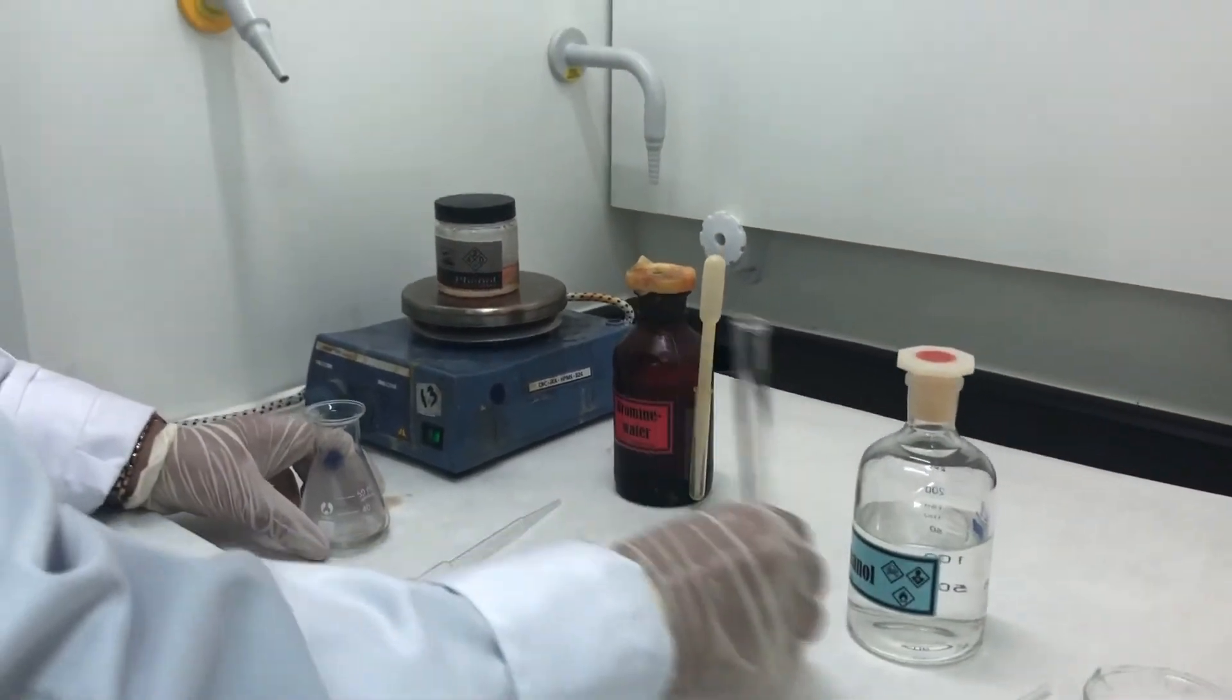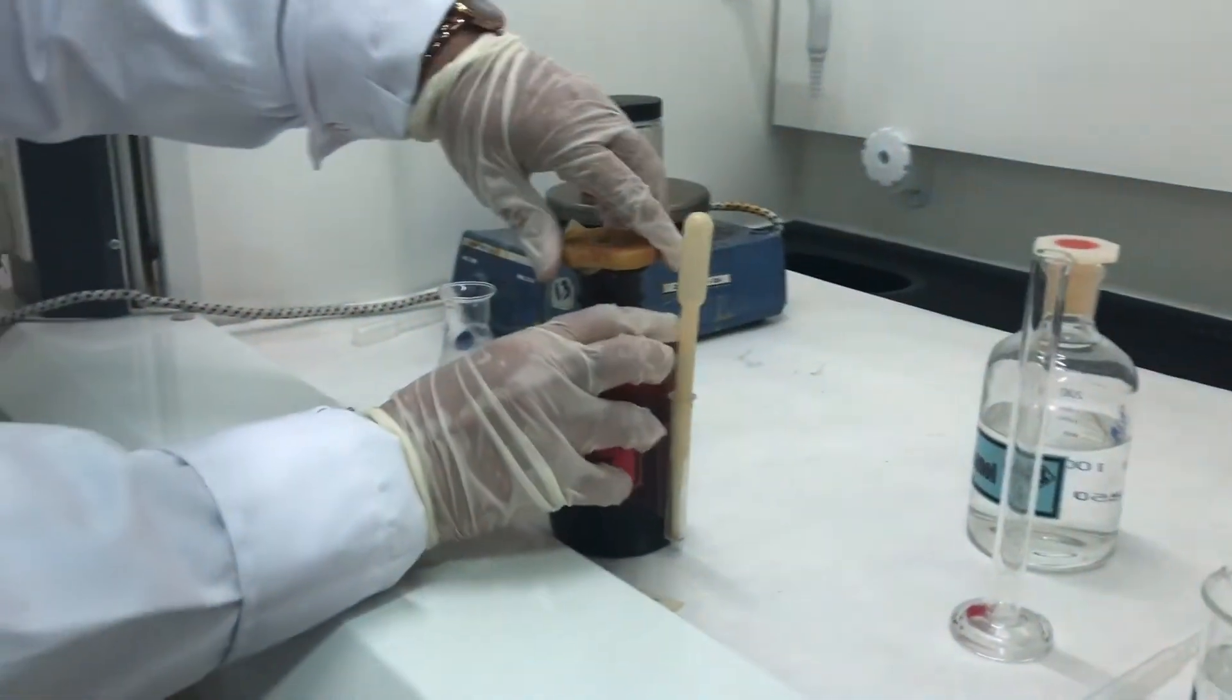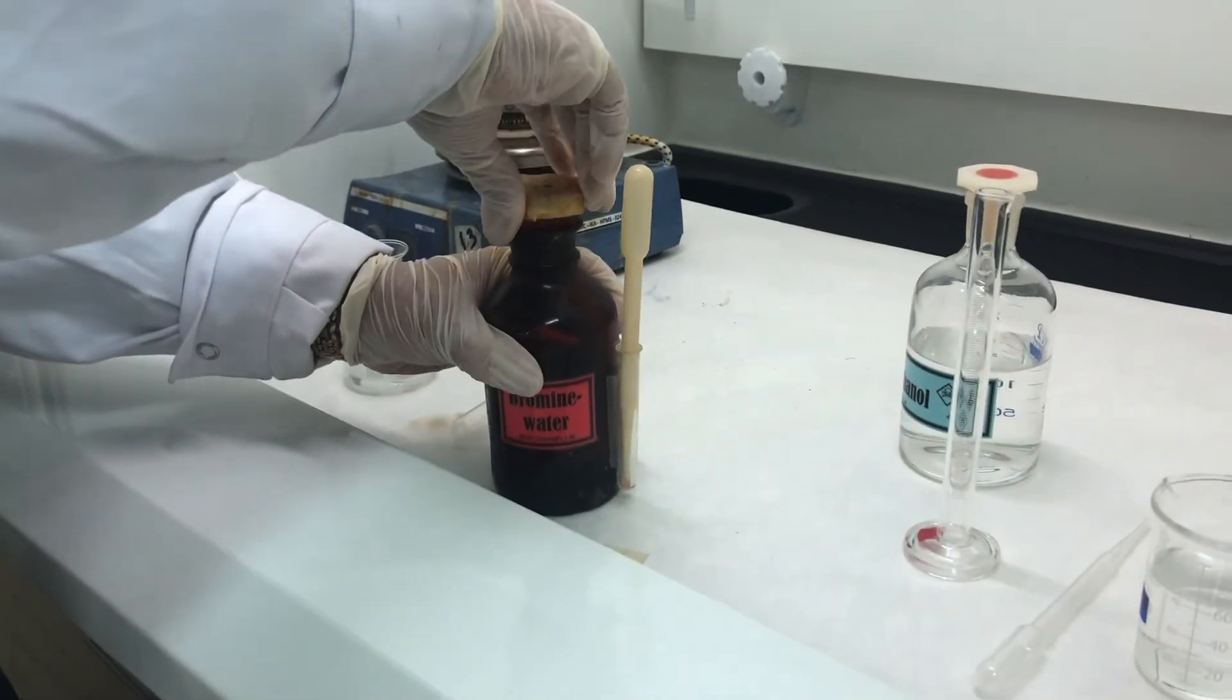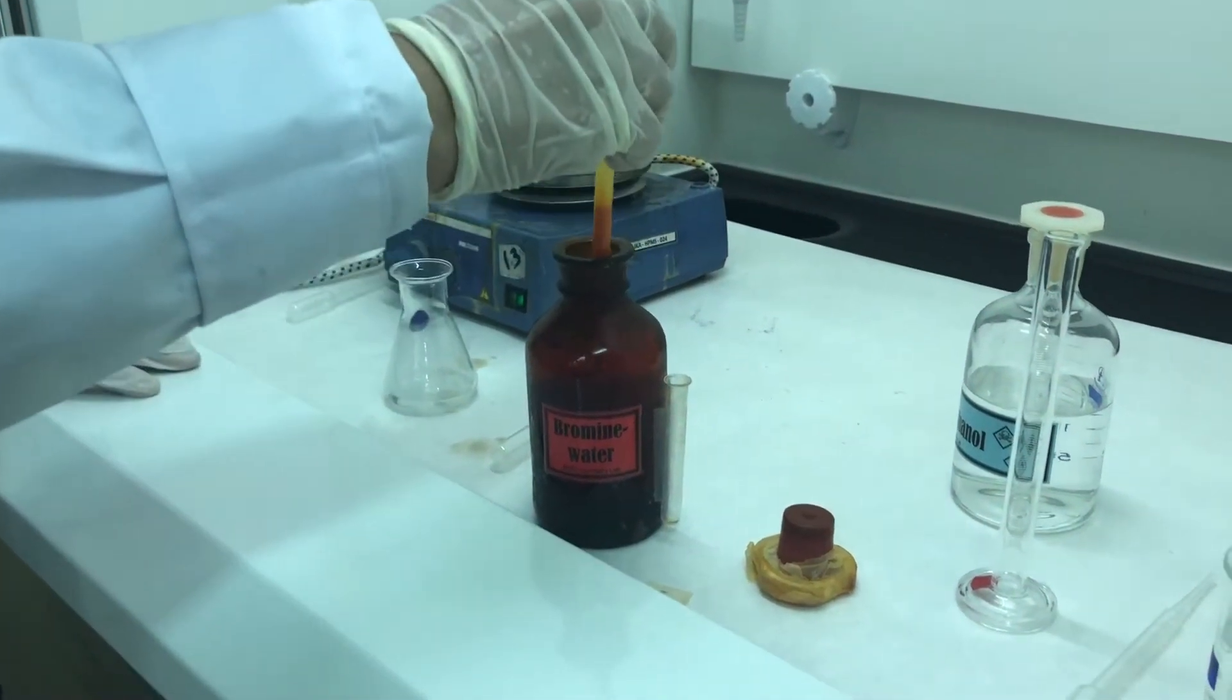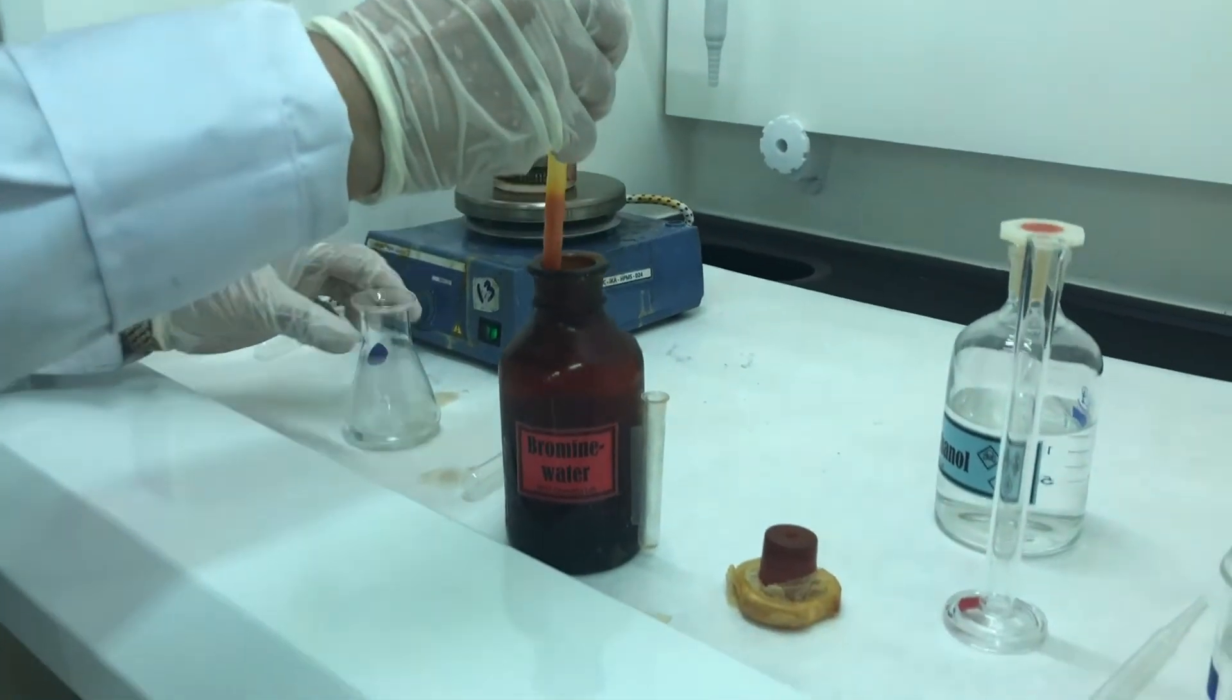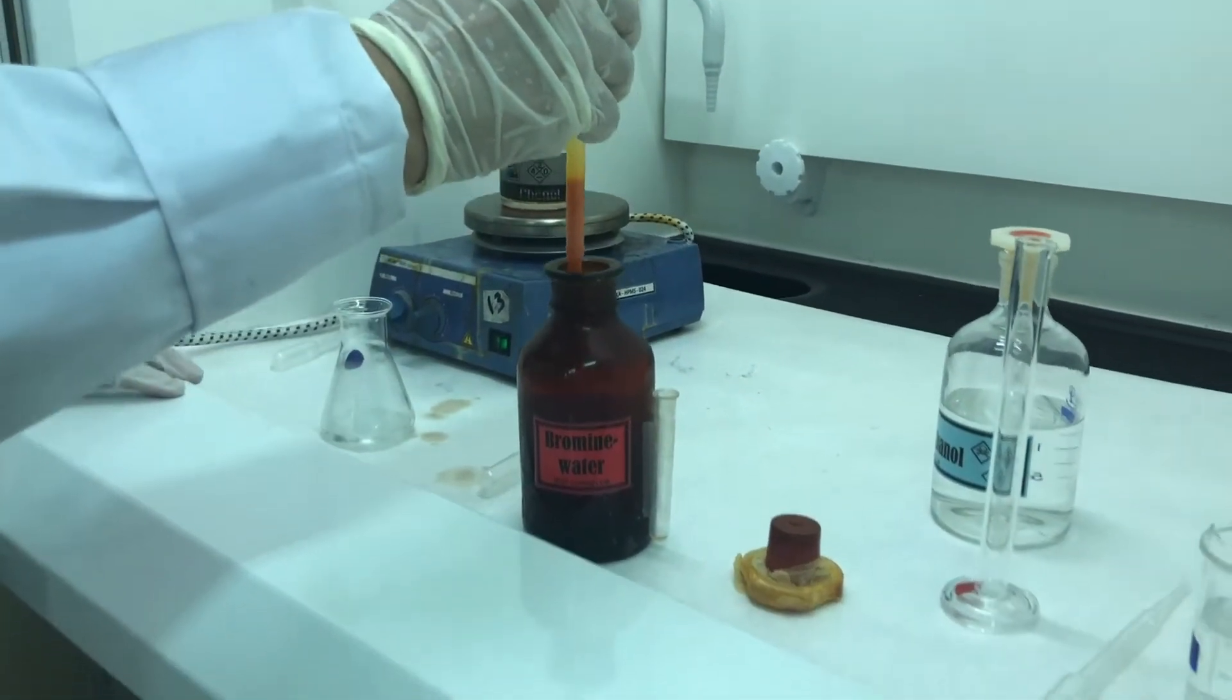So my next step now is coming to bromine. Since we are doing halogenation of phenol, in halogenation we are doing bromination. You have to be very careful when you open the bromine bottle. It's highly corrosive, highly concentrated. Now, as you can see, the color of the beaker, right now it's a colorless liquid, a solution.